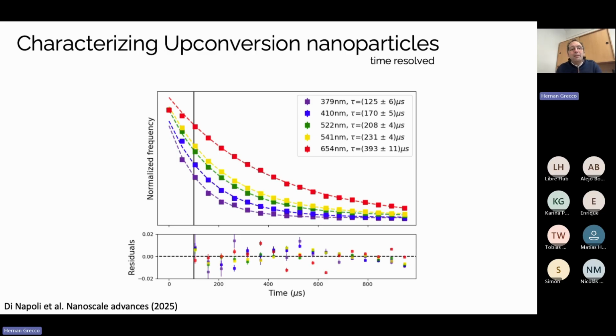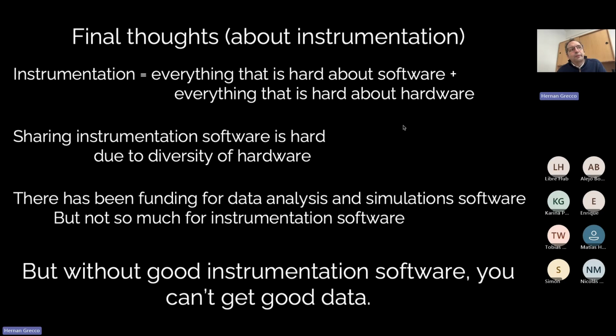So as you see, being able to develop your own software is great because it allows you to first give new life to old devices, and allows you to add new capabilities to them. But I would argue that it also allows you to have more control of your experiments, because you can now program the protocol that you actually need, which might be different to the one that the vendor gave you, right? And so I want to give you some final thoughts on that, and then I'm open to questions.